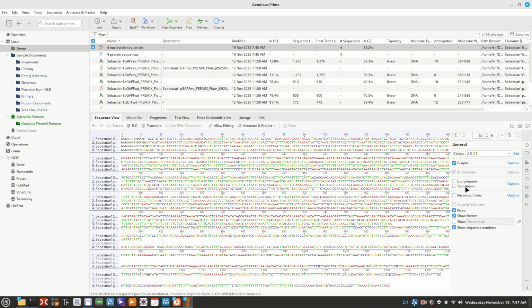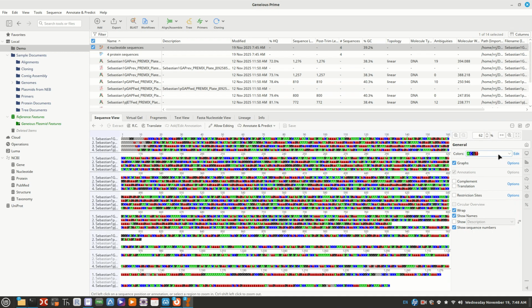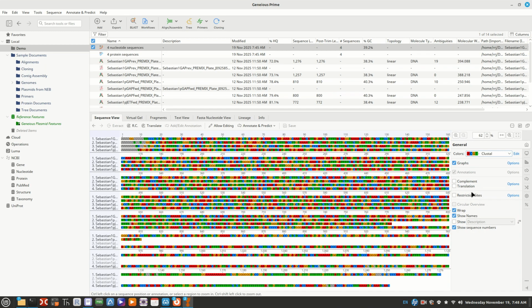Now we don't care about circularizing, as this is not bacteria. So let's see, a description. No, we don't need that. But I do like the wrap part. Okay, just showing you what's going on, we can actually change the colors. I kind of like them a little brighter myself, and with some darkness. Oh, that doesn't look good here though, but on a lot of programs I'll do it like that. Let's see this one, a little too bright there. I guess maybe that is the best one, or one of these first two.